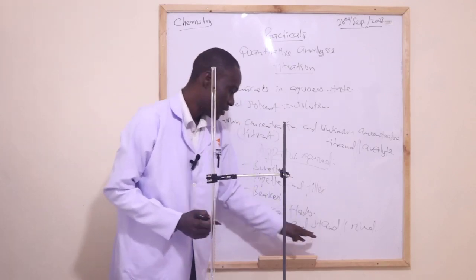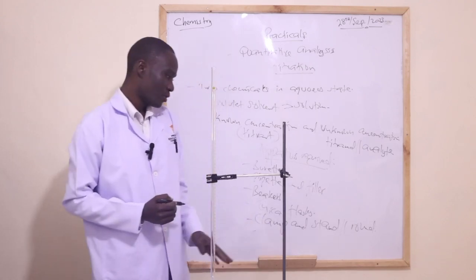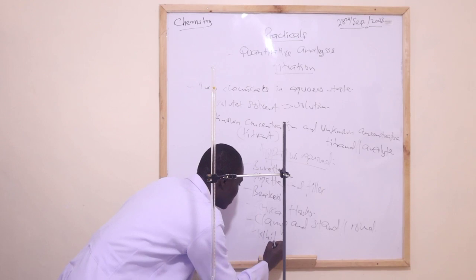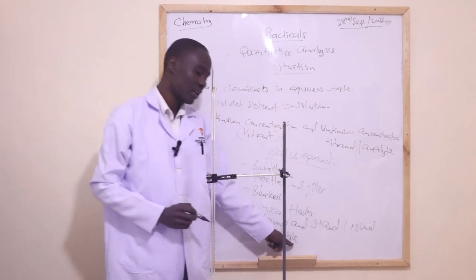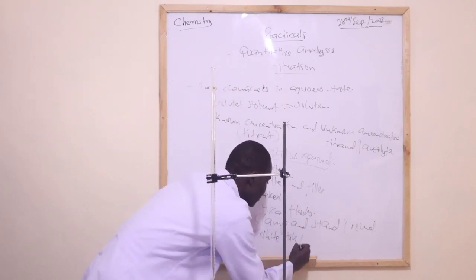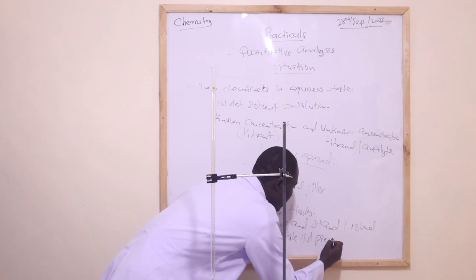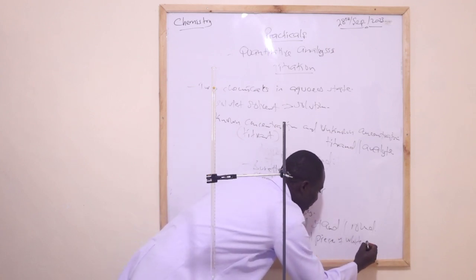Also, I was forgetting the other one. You need to have a piece of white tile. You can use a white tile or a piece of white paper.